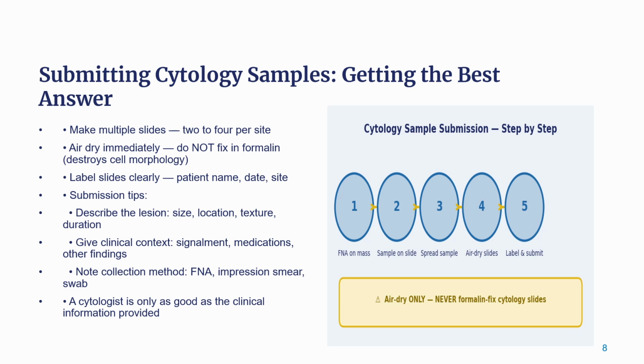Cytology slides are air dried. Make several slides from each site. Sometimes the first couple will be too thick or too spread out, and slide 3 is the one with perfect cell distribution. And fill out your submission form with real clinical information.